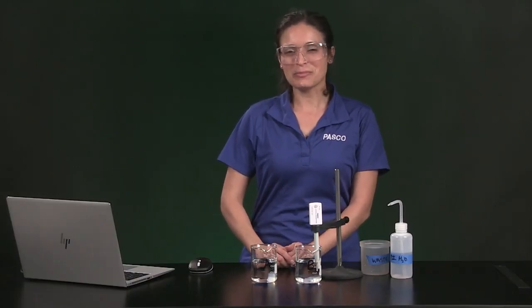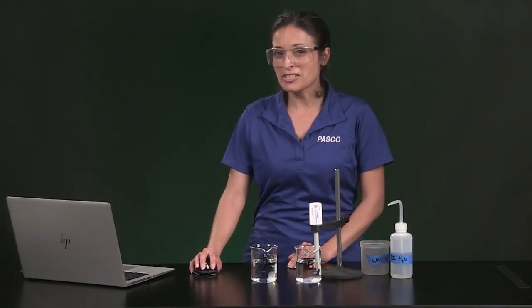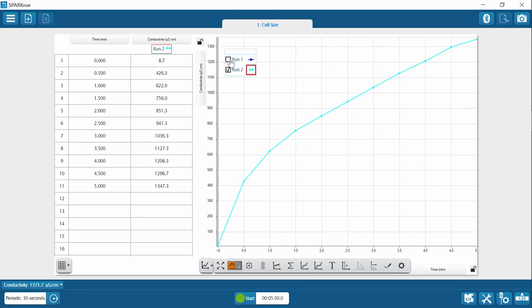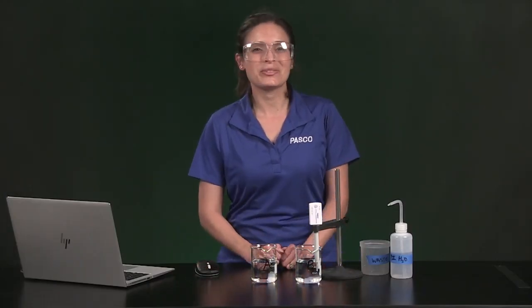You can use the coordinate tool in SparkView to see what the initial and final conductivity values were. When I turn on the tool, I can move the gray box and set it to whatever data point I want and I can remove it by clicking the X. You can make run visible again by checking the box in the legend. Make sure you move the red box in the legend to the run you want to analyze. You now have enough information to complete the analysis and answer the questions.